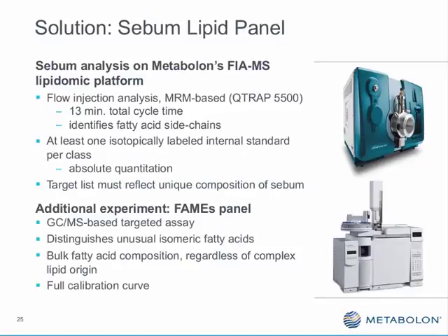To address the final question as to how we deal with the isomeric fatty acids, there's actually a specifically designed FAMES panel that is performed in order to correctly identify those fatty acids, which is actually done on the bulk material.